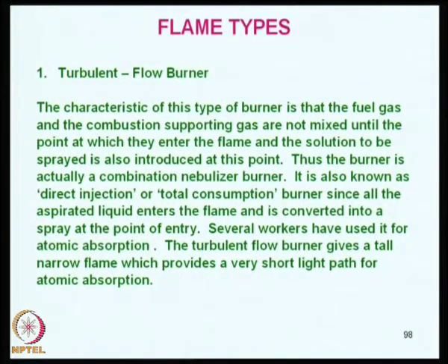We will continue our discussions on the flame types in atomic absorption spectrometry. We were discussing the flow burners. There are basically two types: one is the turbulent flow burner, and another is the premix burner.